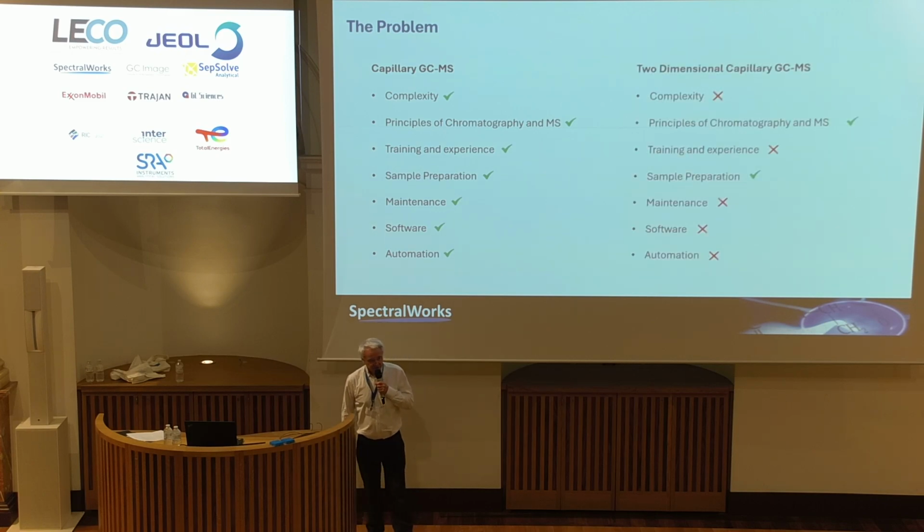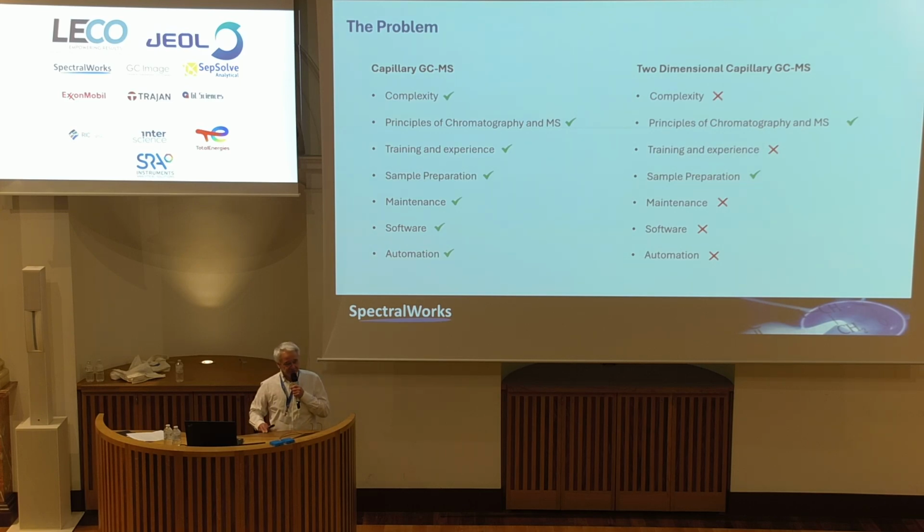Let's move on to the 2D GC. It's complex in people's minds. The principles of chromatography and MS remain the same. Training and experience, people are often frightened of it.